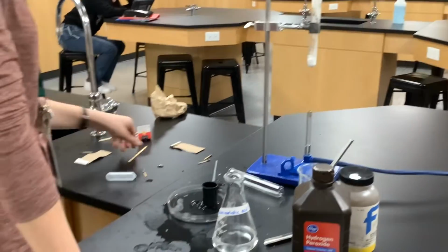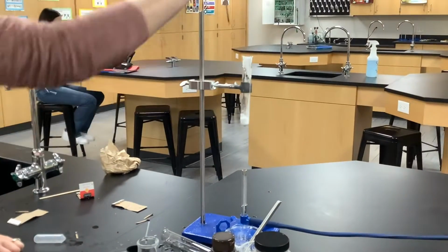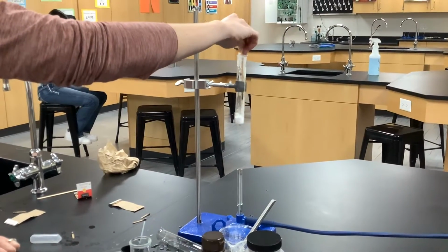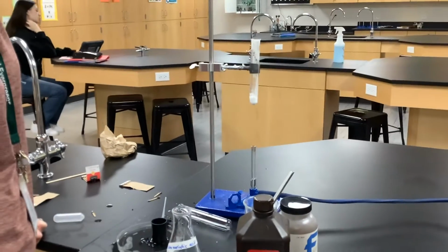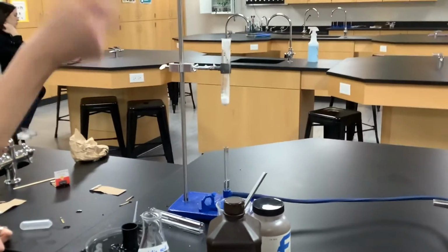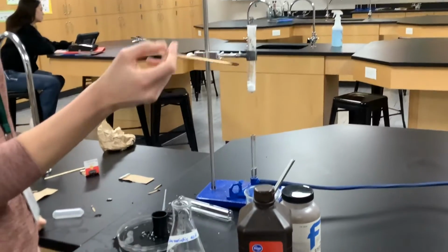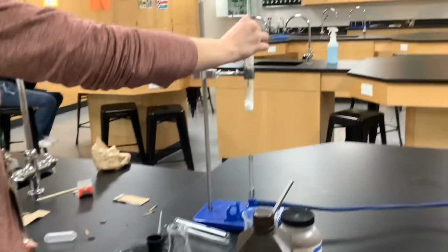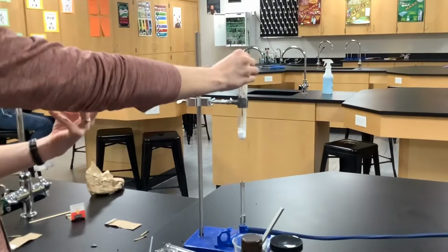Once we capture that, we're gonna take a burning splint with the flame on it and put it in there. What is that flame gonna do when it's in the carbon dioxide? It's gonna go out. What's in the fire extinguisher? Carbon dioxide, yep. So we put it in there, it's gonna essentially smother the flame, because it's not gonna have that oxygen gas to be able to keep burning.